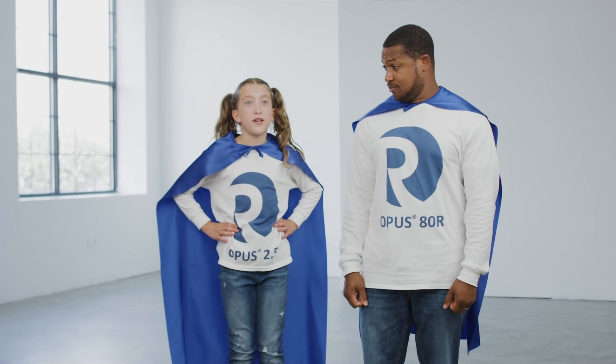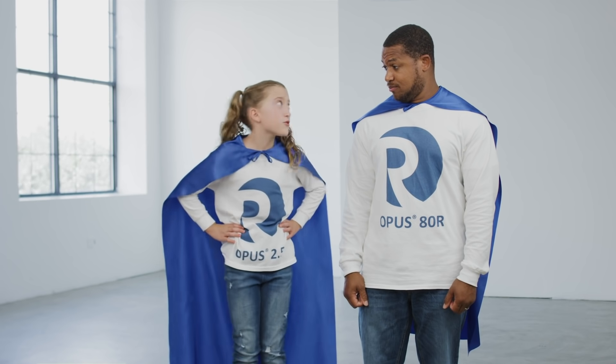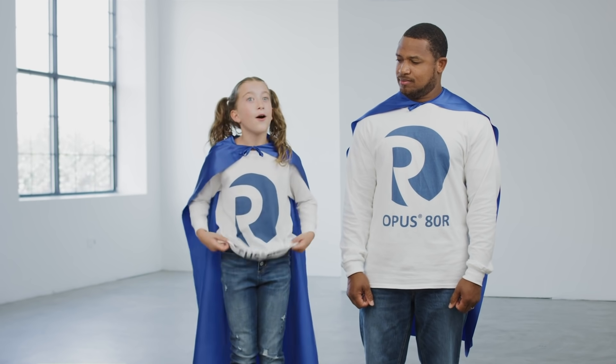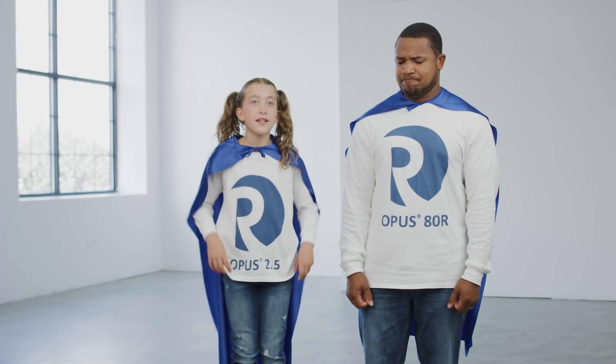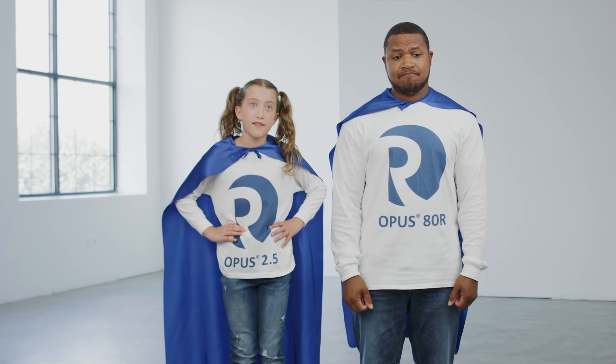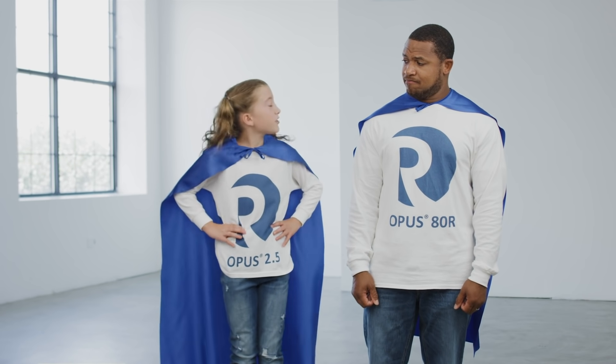The Opus family of prepack columns now includes 12 sizes, with the newest one being the small but mighty Opus 2.5. Depending on the process and application, the new 2.5 cm Opus column might just be the perfect fit.